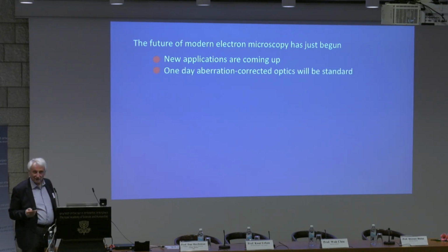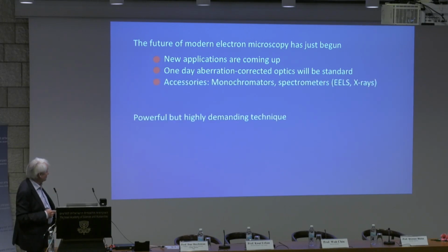One day, aberration correction, I think, will be standard in essentially all microscopes.